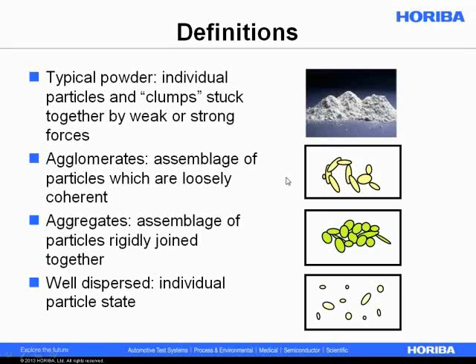If we talk about agglomerates and aggregates, there is an agreed-to terminology here. We generally talk about agglomerates being clumps or assemblies where the particles are held together by loose forces, and maybe these could be broken apart fairly easily just by energy or reducing surface tension. But aggregates are usually held together by much stronger forces, maybe covalent electron sharing, maybe some kind of stronger chemical bond, and these are actually much more difficult to break apart.